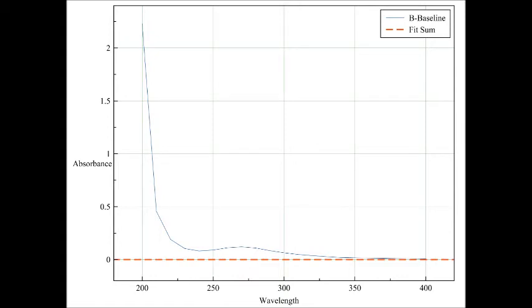I have to say that I was really excited using this machine for the first time, and also I should say that I used distilled water as my blank or reference solution, and a five percent ribose solution made using distilled water as my sample.